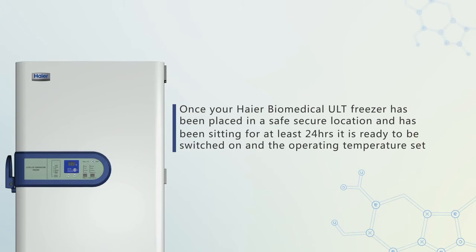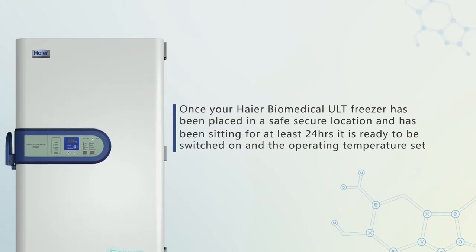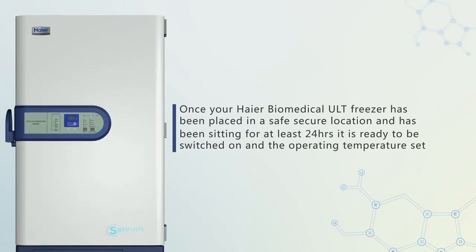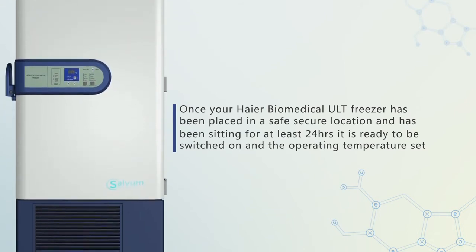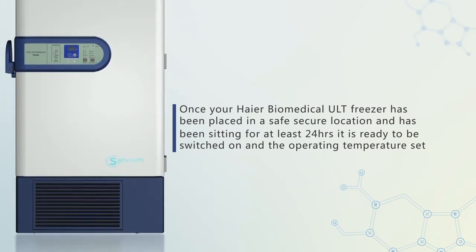Once your Haier Biomedical ULT freezer has been placed in a safe secure location and has been sitting for at least 24 hours, it is ready to be switched on and the operating temperature set.